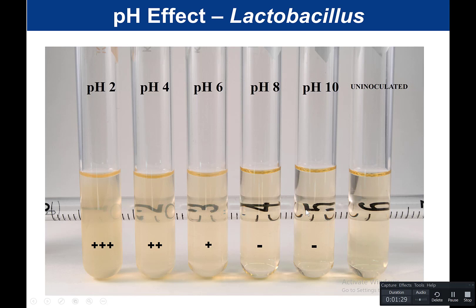In the uninoculated control, you can see the number 6 very clearly. Comparing pH 10 and pH 8, they look about the same as the uninoculated control, so we say that bacteria did not grow under pH 8 and pH 10. At pH 6, we can start to see a little bit of turbidity — the number is not quite as clear — so we quantitate that as 1+, meaning just a little bit of growth.